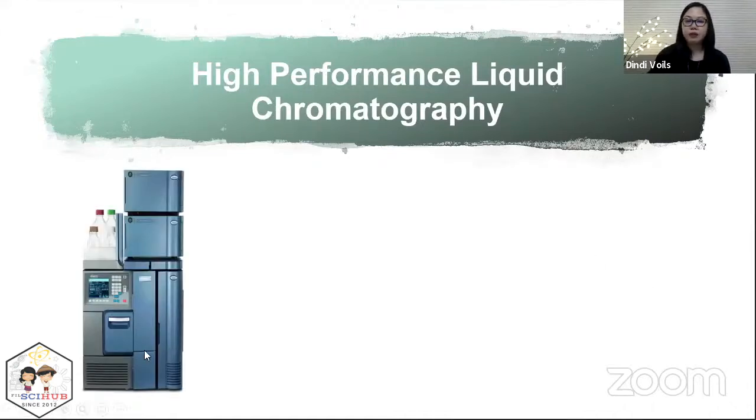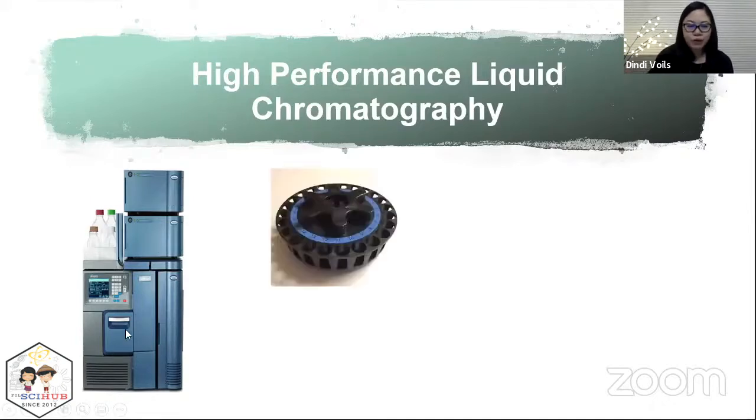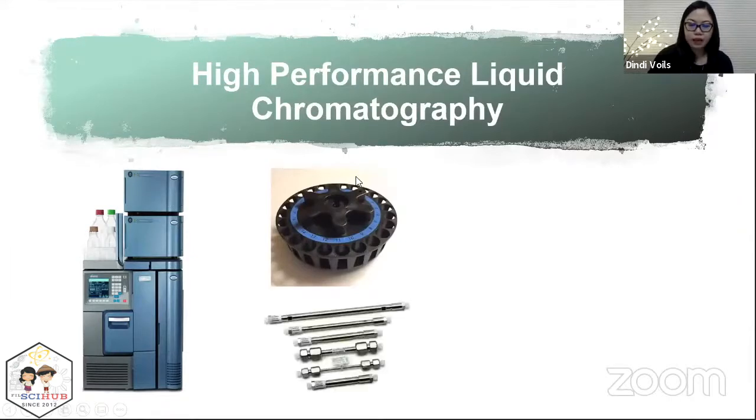So the HPLC that I'm really familiar with is the ones from Waters. I'm not advertising them, but this is just what I've used many times, like 100 times. If you open this compartment, you will see a sample carousel for autosampling, and then this is what a typical HPLC column looks like. These bottles are just your solvent containers, or your mobile phase containers, and solvents for washing the system.